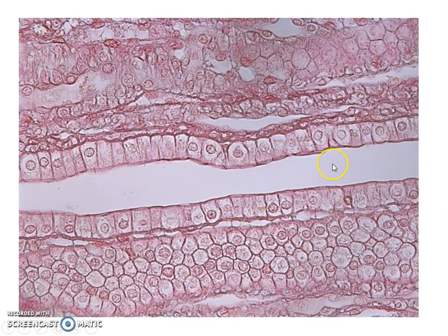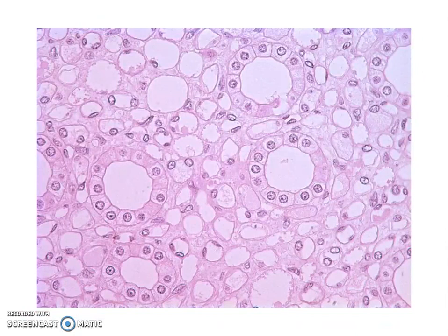Now here we see kidney tubules that have been cut in longitudinal sections. So you see this long, thin lumen that should make you think, we've got epithelial tissue here. And then looking at the cells on either side of the lumen, some of these do look kind of column-shaped, but when you look at most of them, they are more cube-shaped cells. So it's a single layer of cube-shaped cells. This is simple cuboidal epithelium.